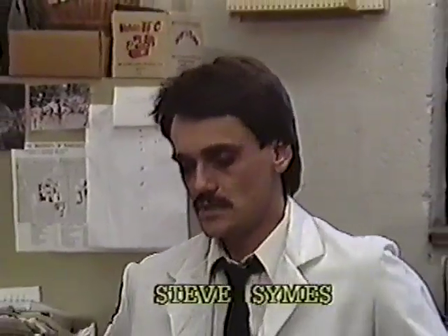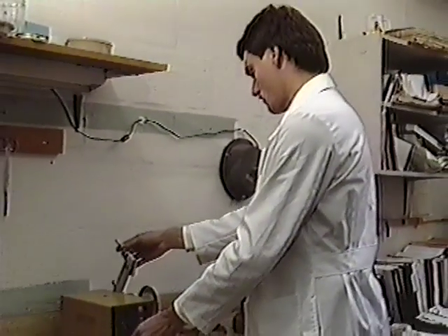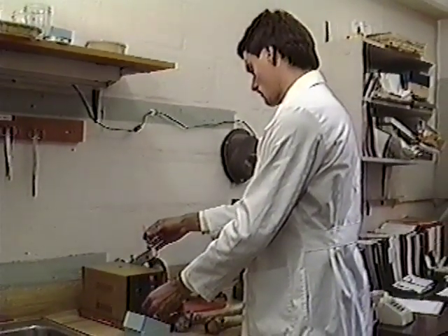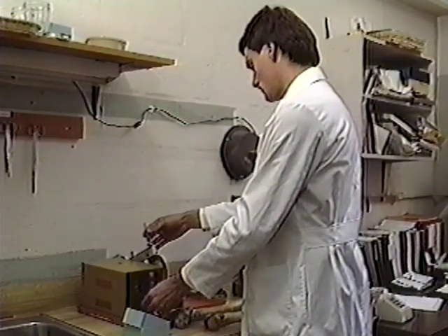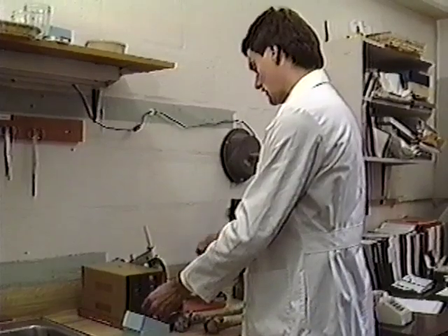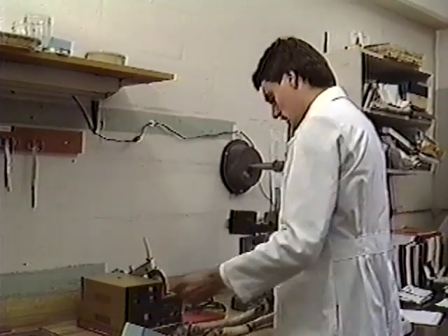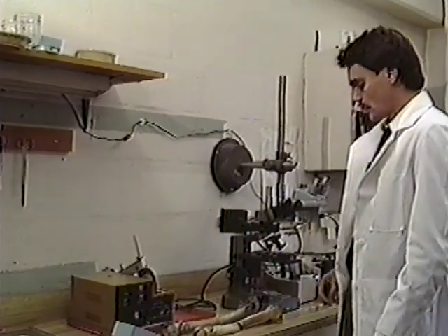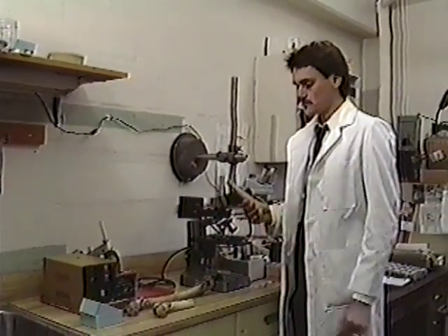Over here I have a bone ready to cut, and I'll start it. At the same time, I'll explain this technique of Dr. Curley's. He starts with a major bone of the leg. In this case, we have a femur.